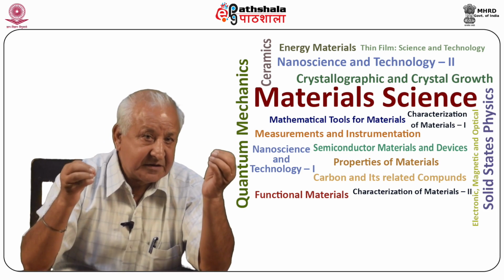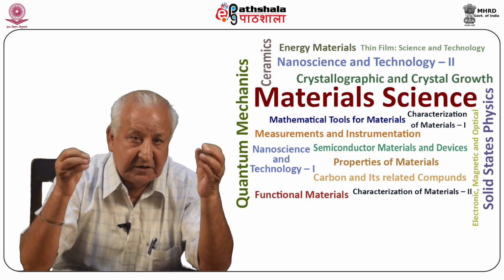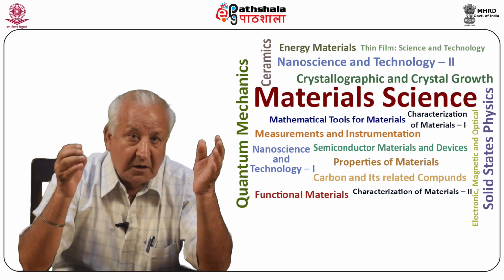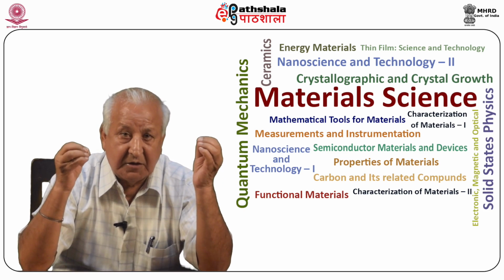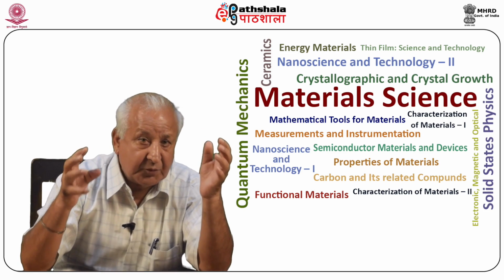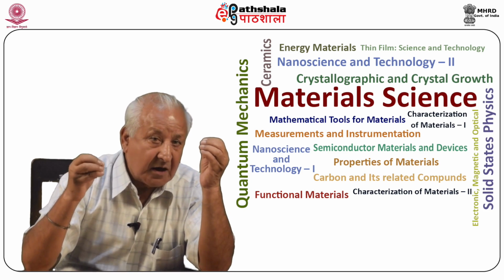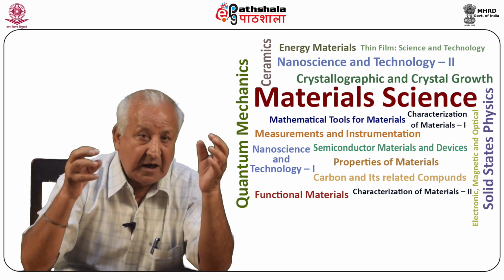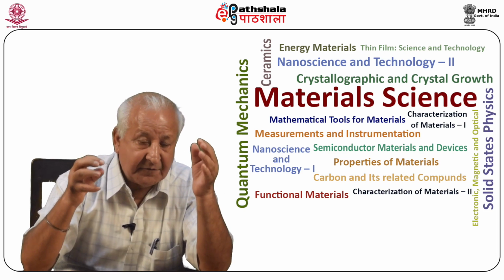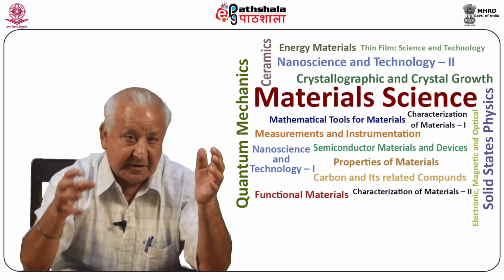The gel must remain stable in the presence of reacting solutions and should not react with these solutions or with the product formed. Two aqueous solutions of soluble salts are appropriately selected and allowed to diffuse through the gel so that there is a slow and controlled segregation of ions and molecules, leading to formation of precipitate of an intermediate phase as a result of chemical reaction. The crystals grow out of the precipitate.